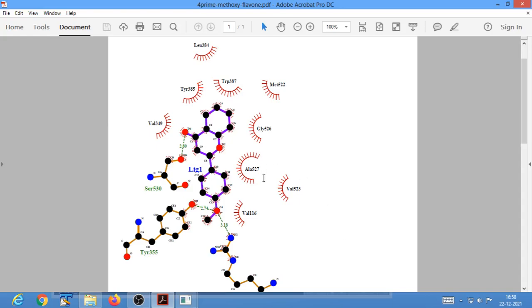There would be some molecules that are usually the main focus of interest, so let us make sure that these molecules remain the focus of interest in our view as well.